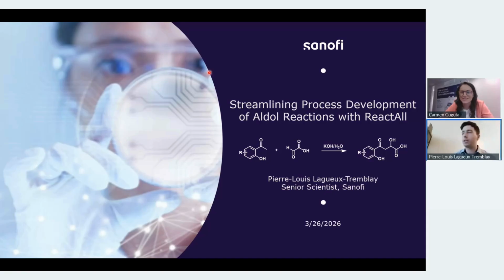I don't want to speak in terms of telling what Technobis is doing or not, but there's a filter adapter that you can put at the bottom of the sampling that we've used also, which can help prevent clogging in the later tubing. That is a little bit more annoying to fix if this happens. But in my experience, I didn't have much trouble with heterogeneous reactions for sampling.